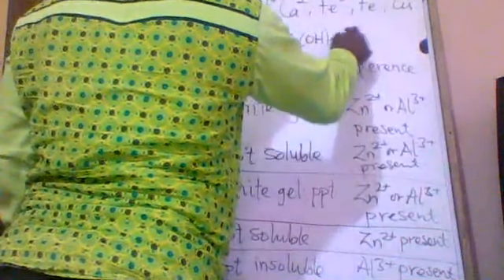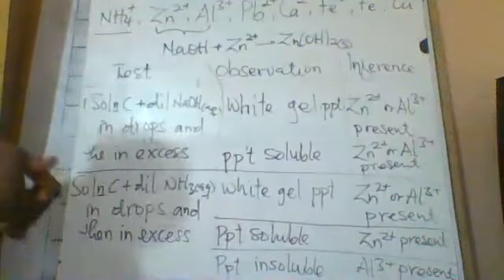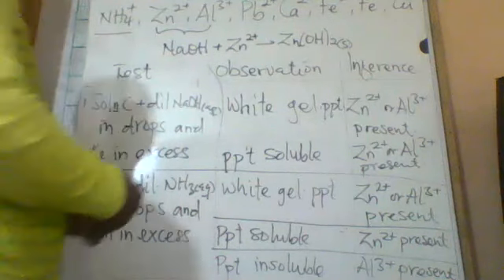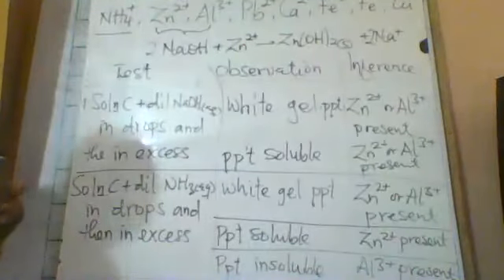This one is solid. It is insoluble. You are going to form this plus Na+. You can balance the equation to that effect. This is the reaction occurring there.